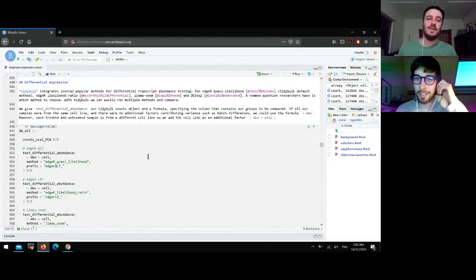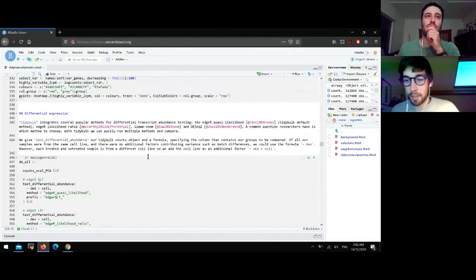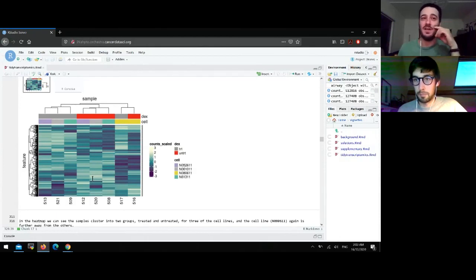Okay, so Stefano, sorry, Eileen again asks a question. She says, "Nice color scheme. Is it a good colorblind scheme?" Well, I think the actual heat map here must be colorblind friendly, as it is a light and dark scheme, but it is not from one of the packages that provide those kinds of palettes.